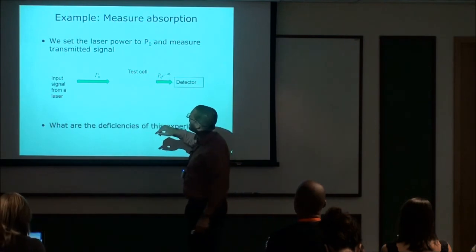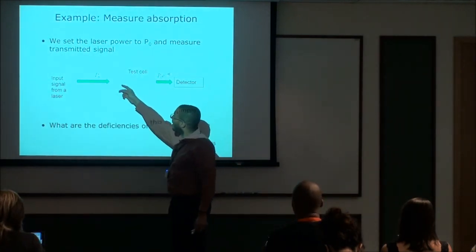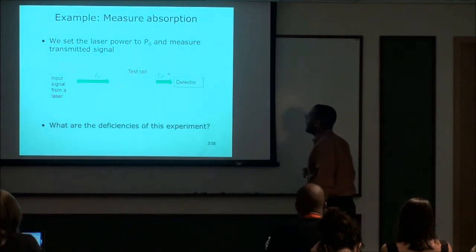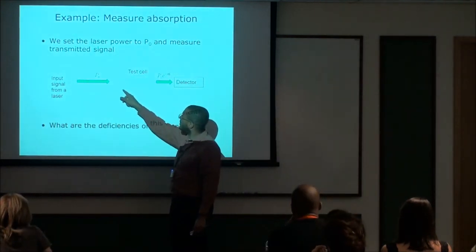Okay, so first what I'd like to talk about is how to measure absorption. So in my slide, there's actually a blue cell here. I don't know why it's not showing up. But what we want to do is measure the absorption that's passing through this test cell.